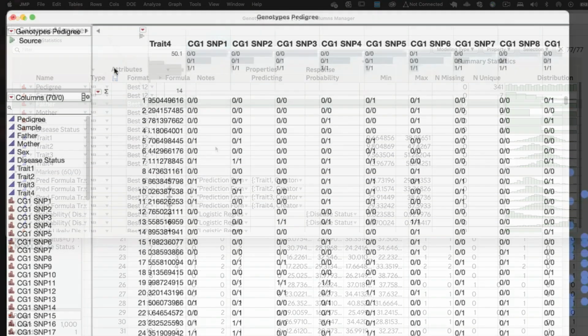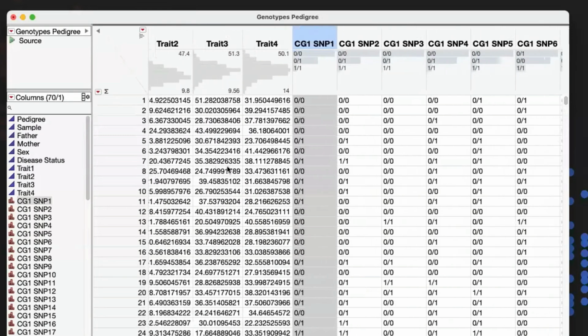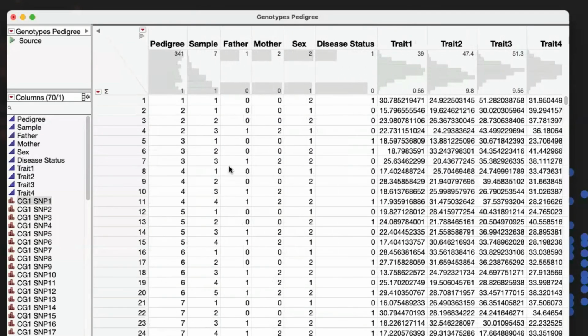So I'm looking at some imported raw format genotype data with 70 columns. Each is a genetic cross of 2 parents, and we have some information on the resulting offspring. For example, a scientist measured several continuous traits, and we have genetic markers or SNPs here that are encoded as 00, 01, or 11. This is whether or not they have the dominant or recessive on each chromosome for the given SNP. So there's some data management to be done.